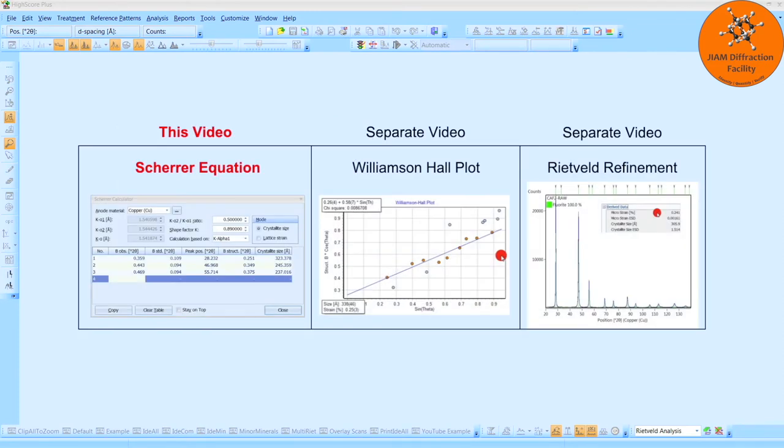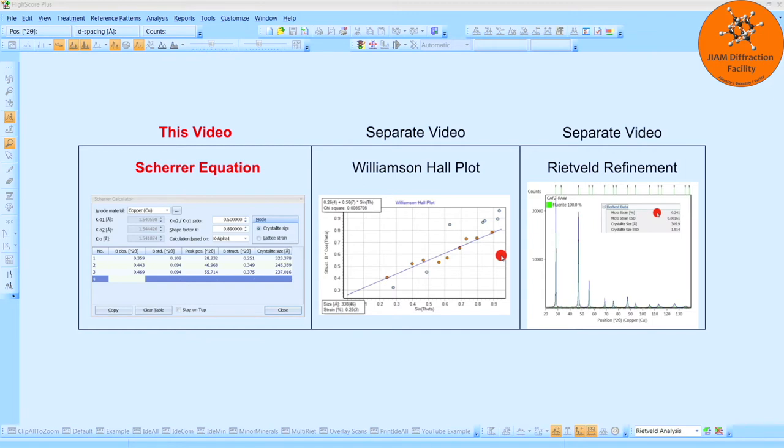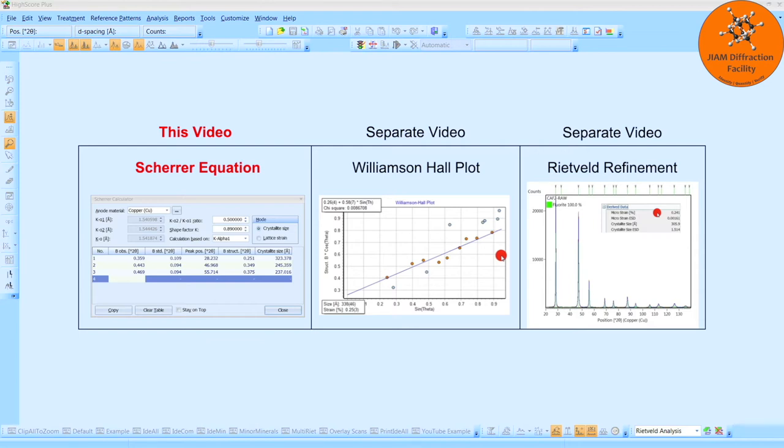In this video, I will show you how to use the Scherrer calculator and HighScore Plus to determine crystallite size. This video is part one of a three-part series highlighting Scherrer's equation, Williamson-Hall plots, and Rietveld refinement, and the determination of crystallite size and microstrain. All files used in this video are provided by Panalytical and should be located on your computer so that you can practice these analysis techniques.